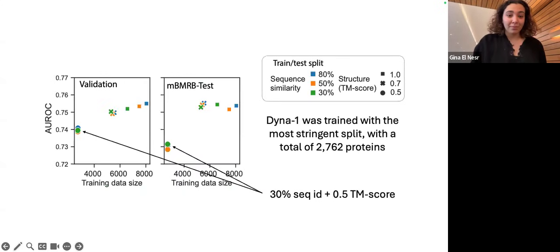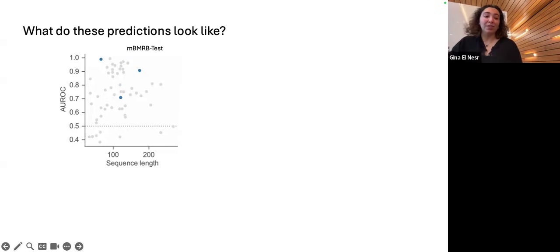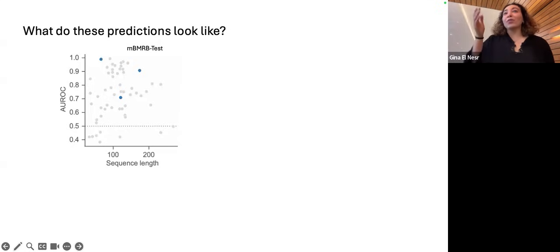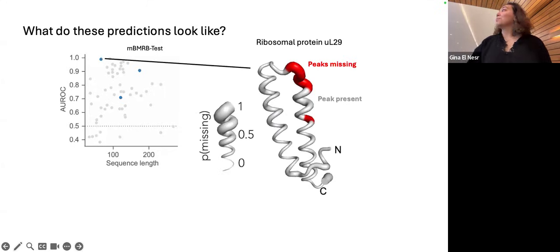Okay. We train with an appropriate split. Please train with appropriate splits. And then our evaluation really is on the RelaxDB that we curated that actually has this interesting information. But first we wanted to say, can we actually just predict the missing assignments? So if we took our naive test set with missing assignments and predicted that, how does that do? This is one of the best performers.